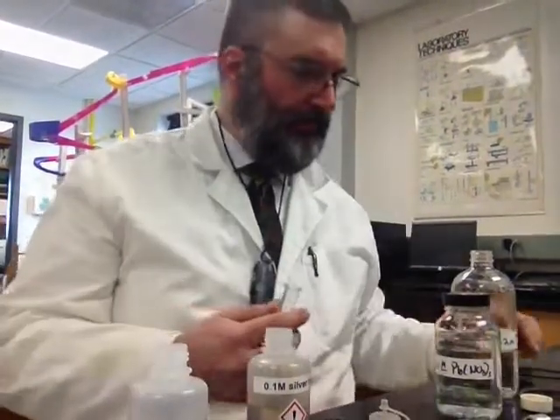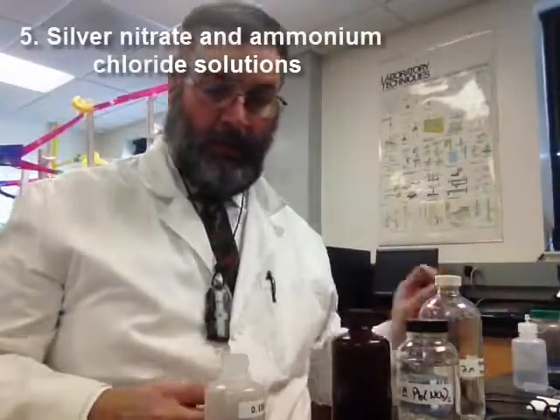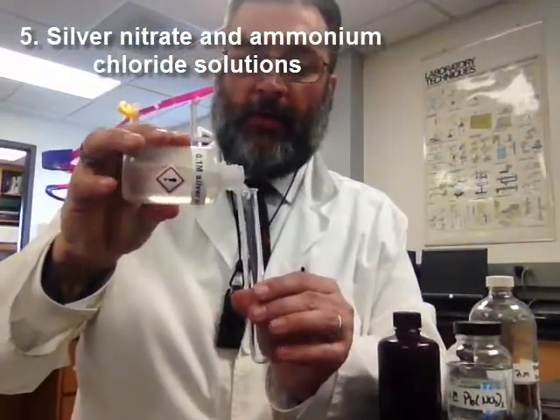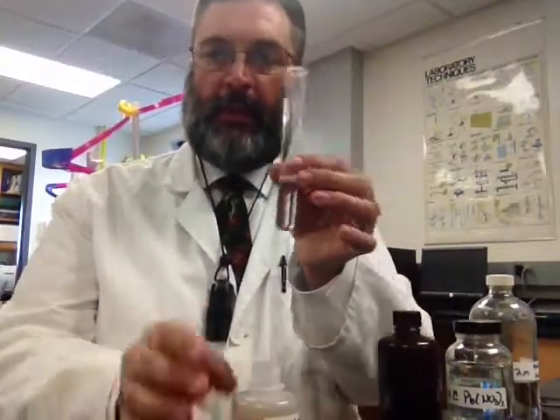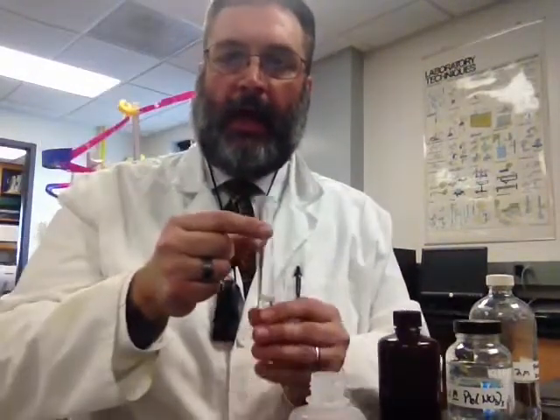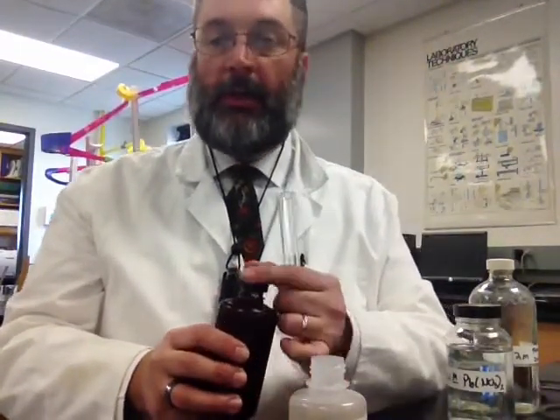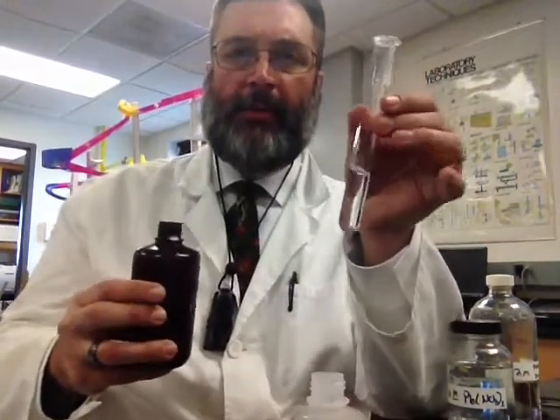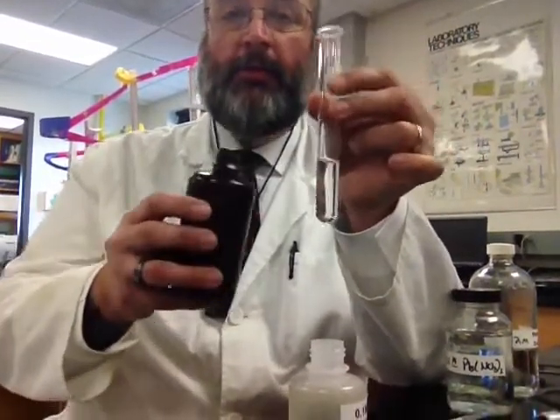So I'll show you another type of reaction like that. For this reaction, we're going to use our silver nitrate again, and you remember what silver nitrate looked like. Clear, colorless solution. And to this, we're going to add a solution of ammonium chloride. Ammonium chloride is also clear and colorless. You'll see as I pour it in that it has no color to it. But watch what happens when it hits the silver nitrate in there.